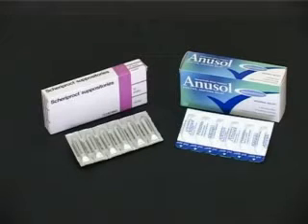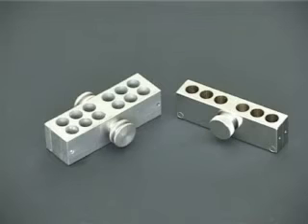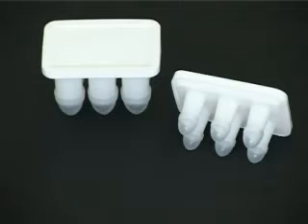Here are examples of proprietary suppositories and their packaging. These are two traditional suppository moulds used in extemporaneous dispensing. Larger moulds, as shown here next to a typical 1g suppository mould, can be used to make pessaries. For convenience, plastic disposable moulds are often used in hospitals.